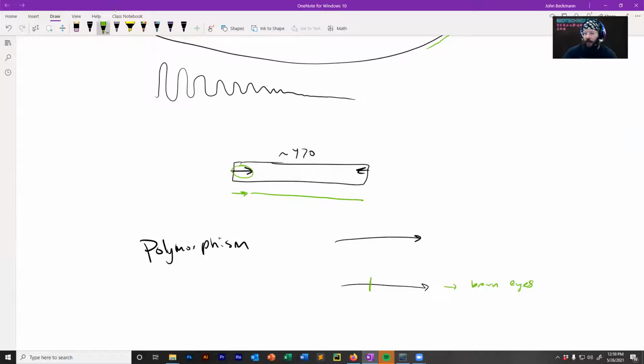But if you wanted to see this single nucleotide polymorphism difference, the SNP, say up here it's an A and down here, in this allele, it's a G, you'd see the same chromatogram, and then at this single position, that spot would be different.